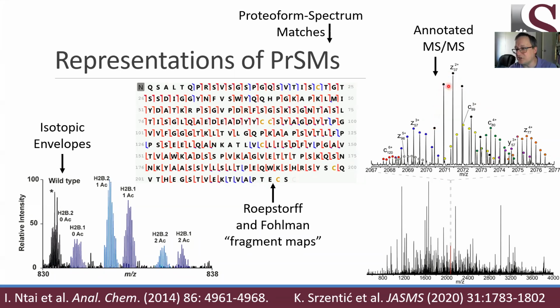Now, that's a much simpler case than when we get to something like this C80 ion. So here, this is the N-terminal ion from ETD. It contains the first 80 amino acids, and it's quadruply charged. So we see that where the Z37 ion at +2 had its peaks spaced every 0.5, the C80 ion has its isotopes spaced every 1/4 of an m/z. It's the reciprocal of the charge state.